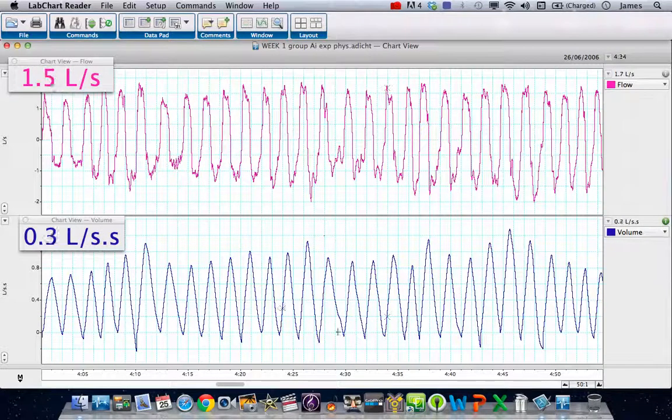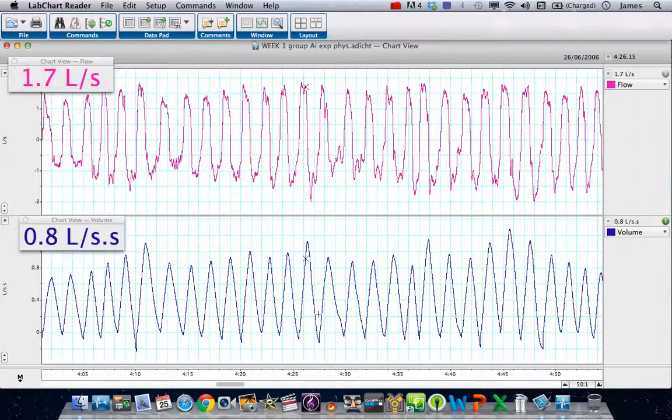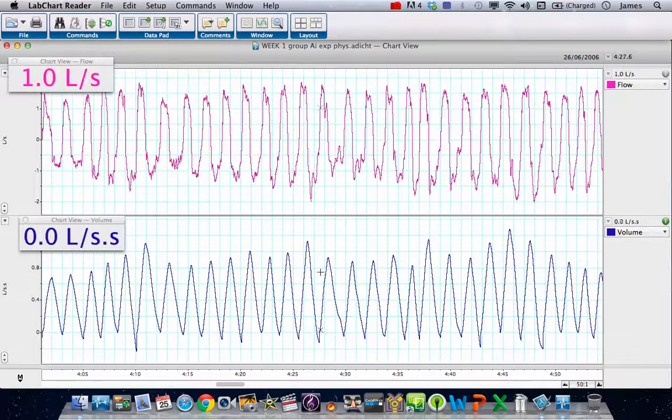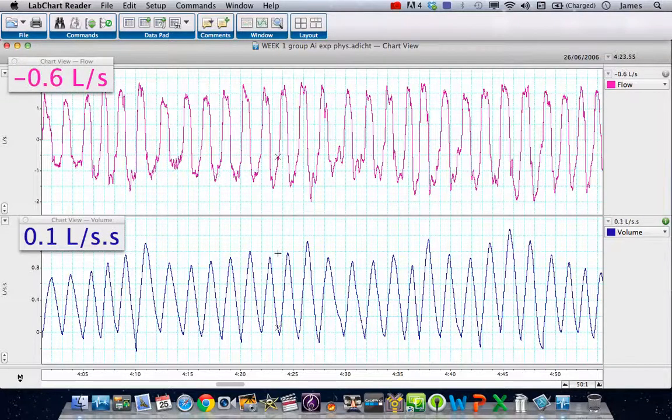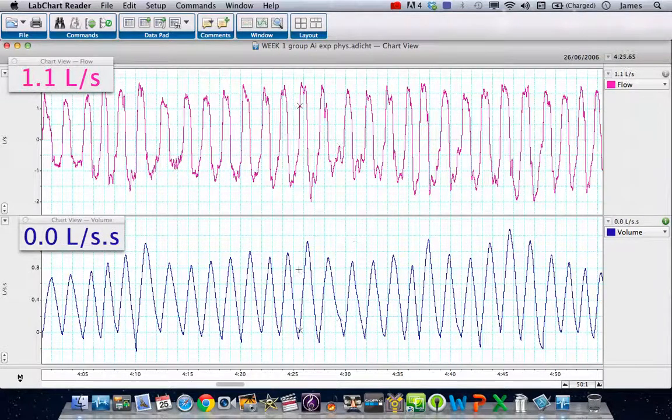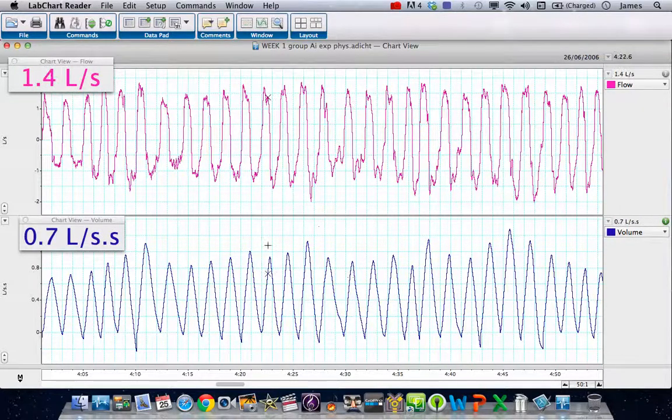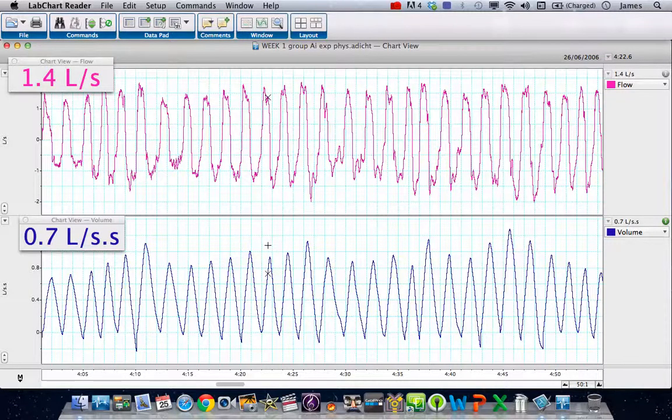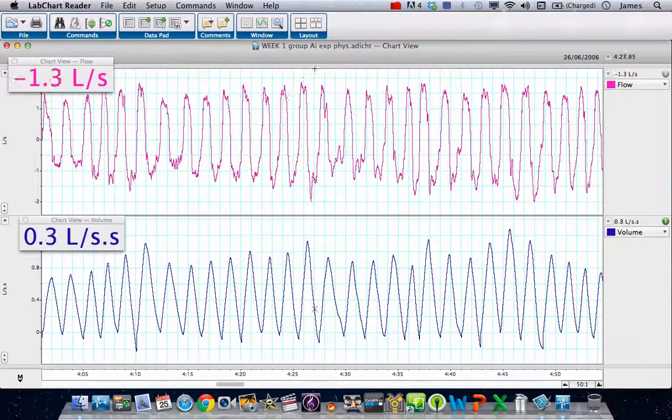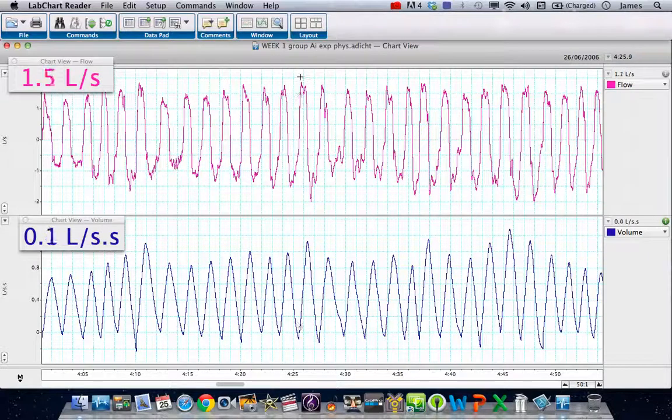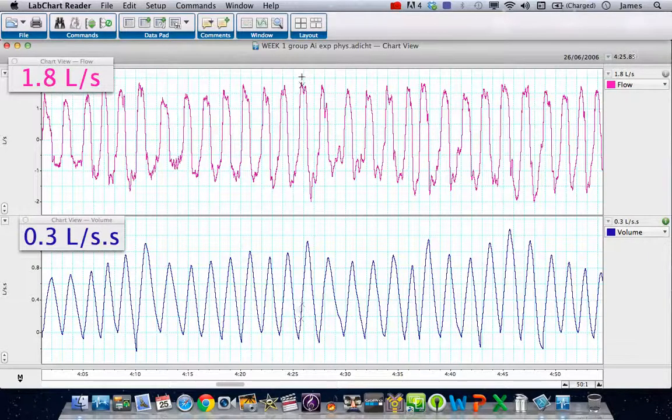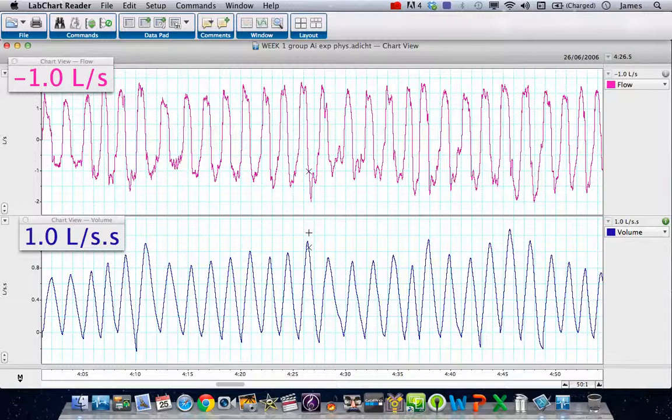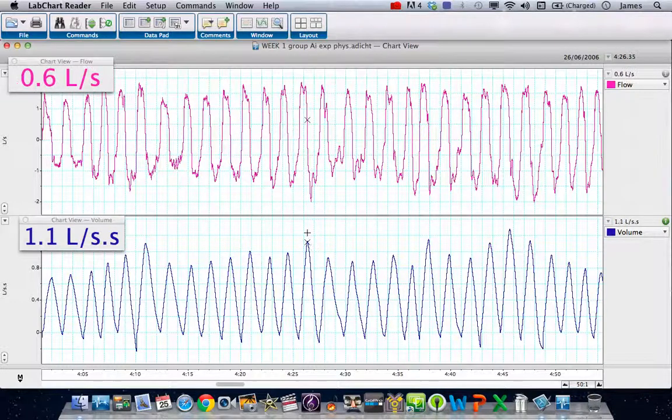Of course, these data just show absolute volume shifts. What we could do is convert that to minute volume shift, which we can do by adding another channel. But at the moment, let's just leave it at that. There is our data. It shows quite clearly now we've got calibrated flow in liters per second and an integral showing us the volume in liters.